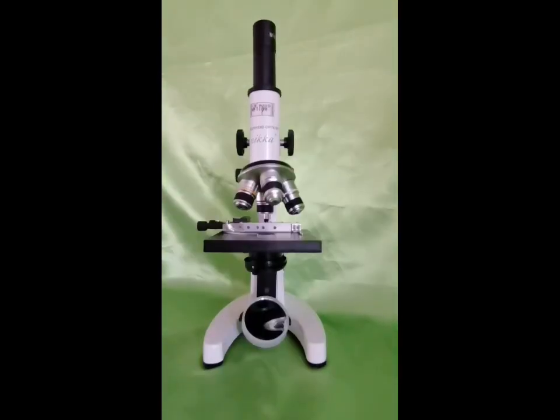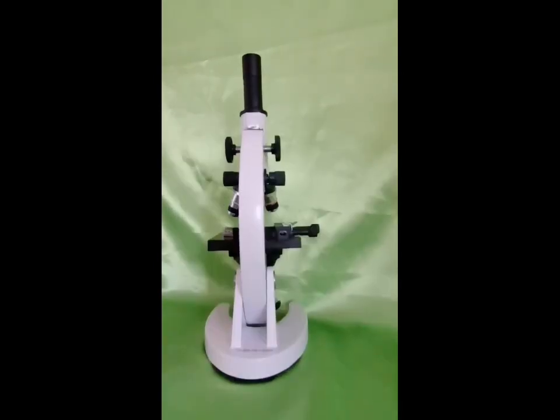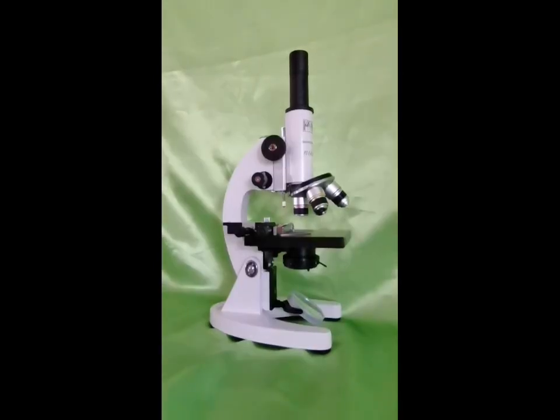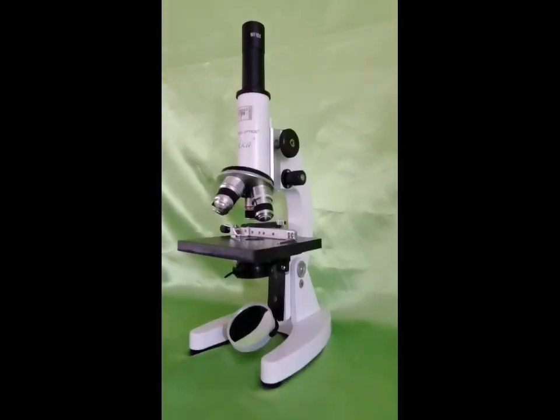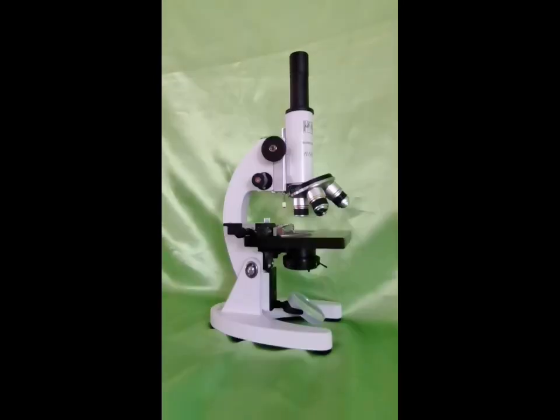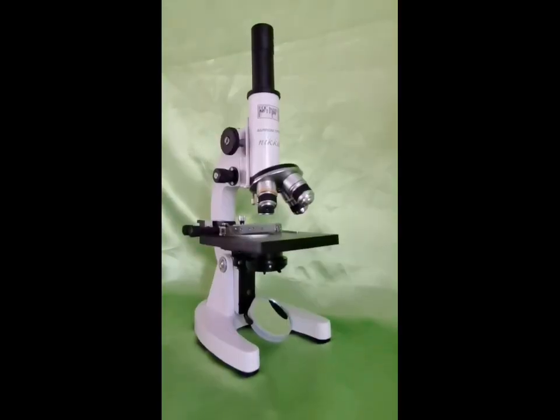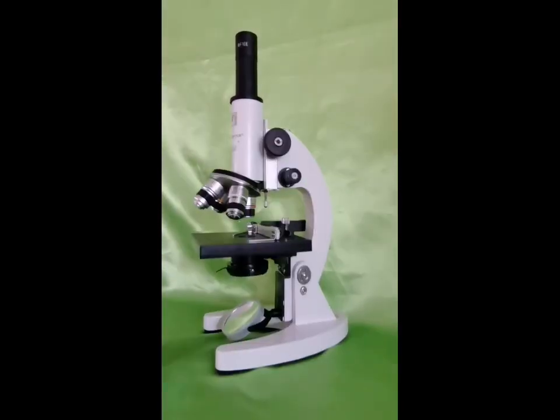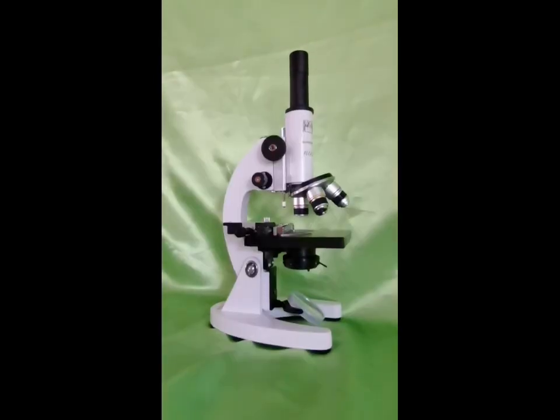In the field of biology, microscopes are used to study organisms and their vital processes. Most schools have compound or light microscopes, which depend on available light in their operation. It is called a compound microscope because it uses two lenses to magnify objects. Compound microscopes have low depth perception but have high resolution and magnification.